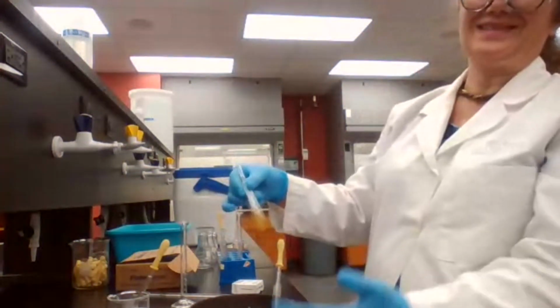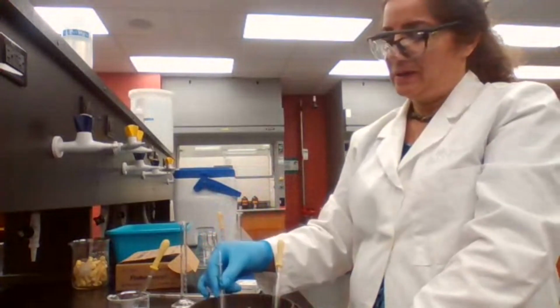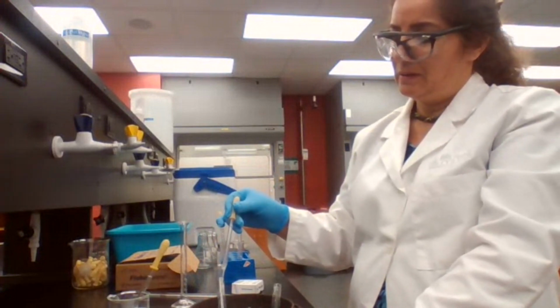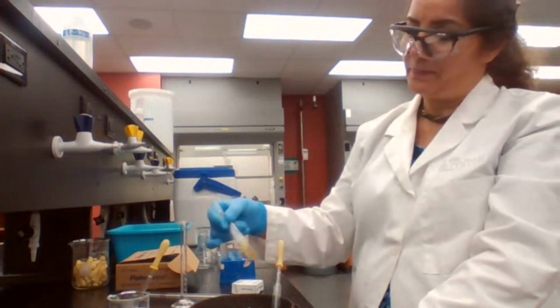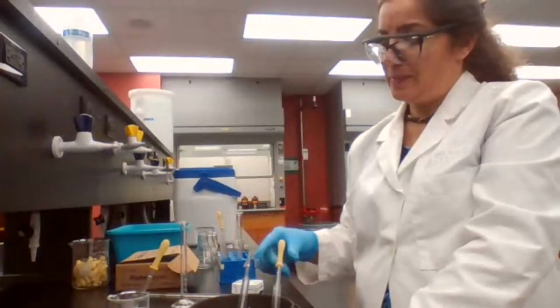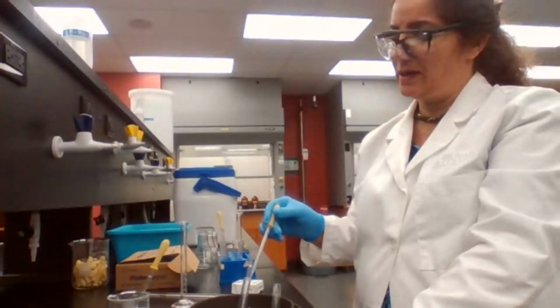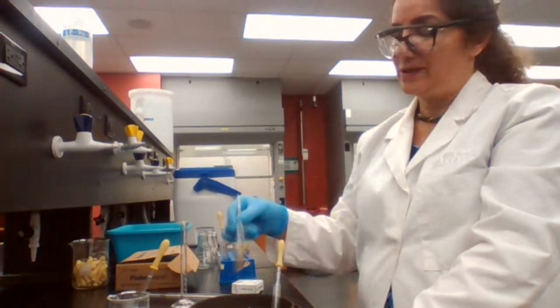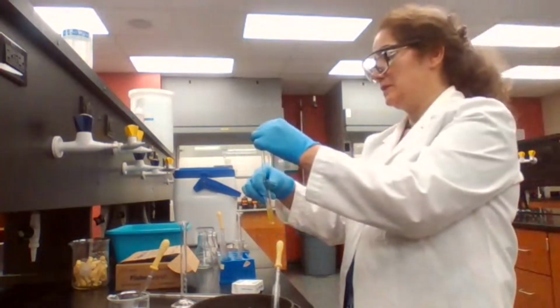So if the color doesn't stay light yellow, it has nothing to do with the heat being generated. It could be contamination of the nitric acid, because I'm carefully adding just one drop at a time. It's not just the sulfuric acid, but I'm dropping one drop at a time of the nitronium ion. Nitronium ion is a mixture of sulfuric and nitric acid, the solution that you prepare in step 2. Two separate trials.